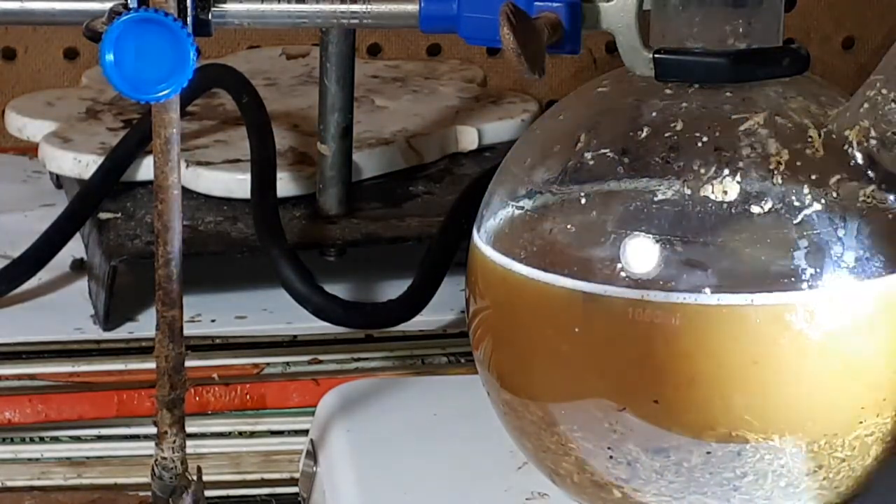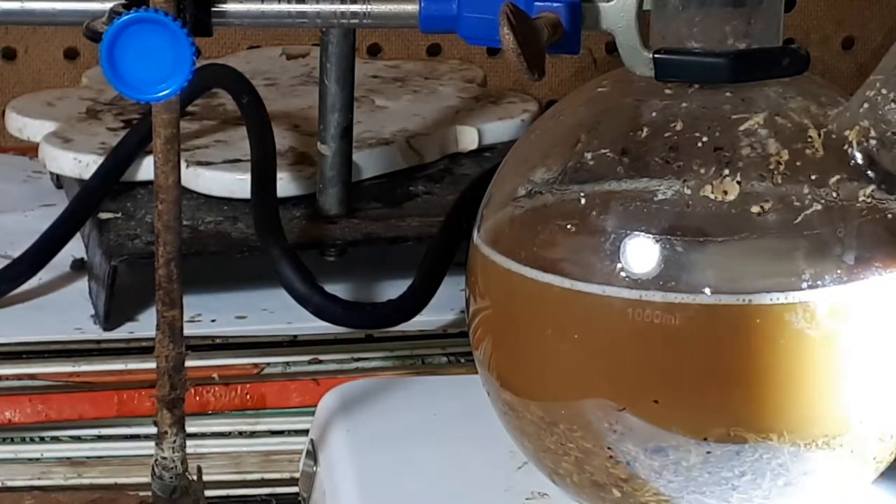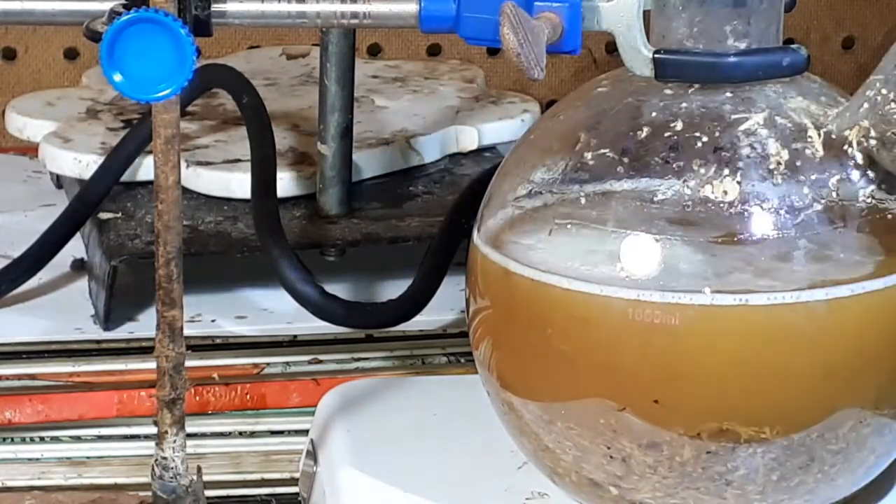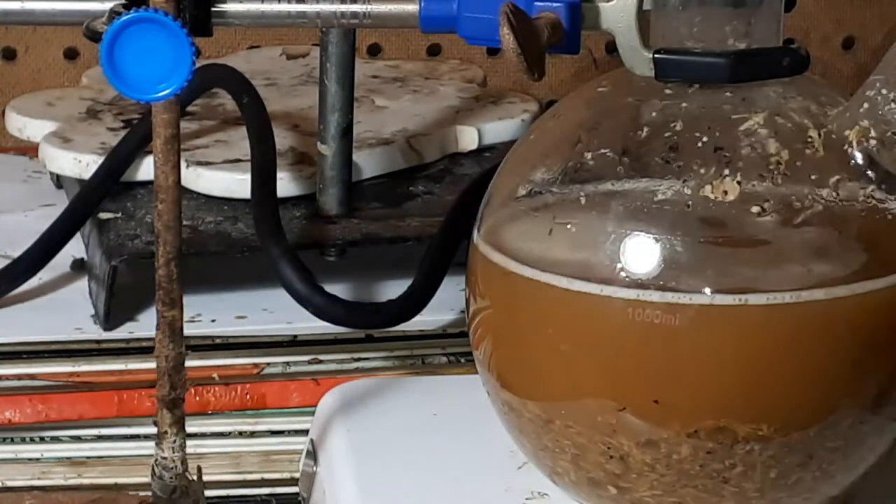Now it stops stirring because there is too much salt inside this one-liter, two-jointed flask.